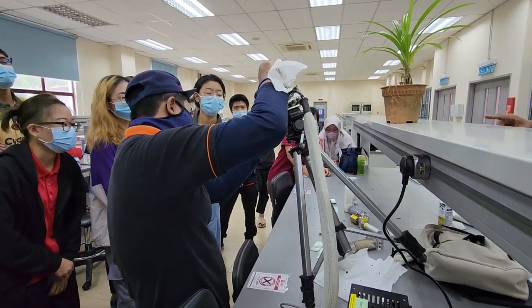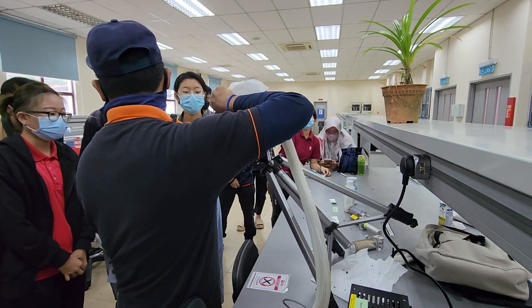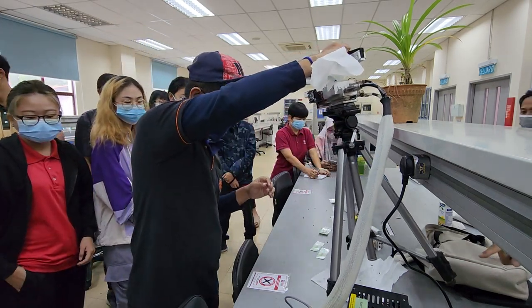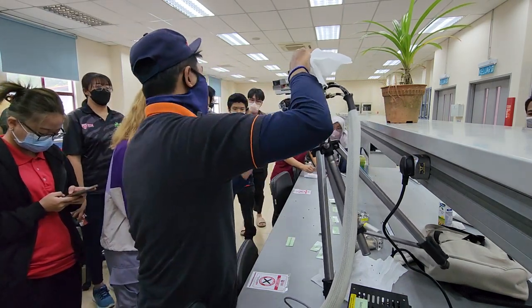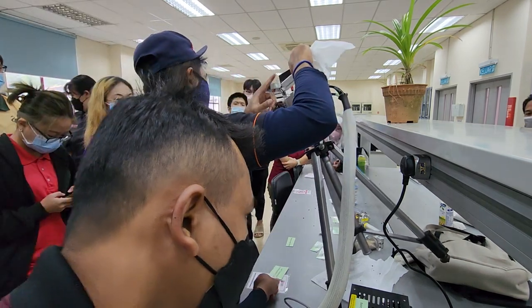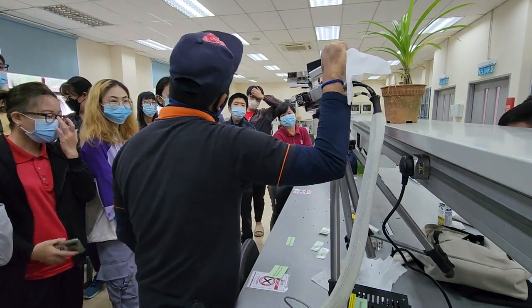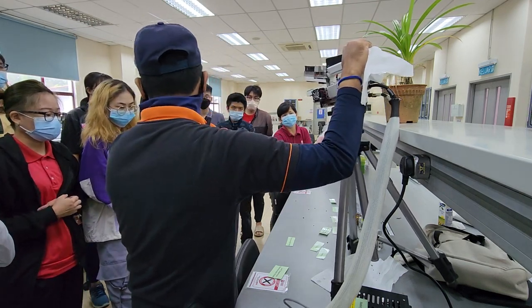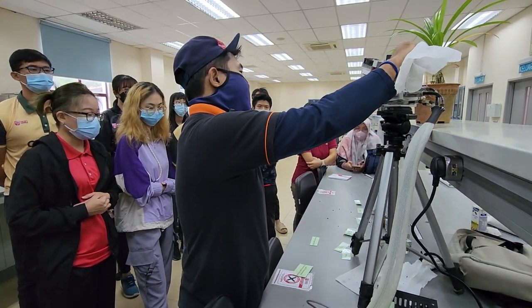Make sure your leaf is touching the spider leg there. You see something like a spider leg there? It's called a thermocouple. Thermocouple is for temperature detection. So the leaf needs to touch this little spider leg here. Otherwise, the machine will not know the temperature of your leaf, and if it doesn't know the temperature of the leaf, it cannot calculate anything properly. So this is the chamber where you clamp your leaf.